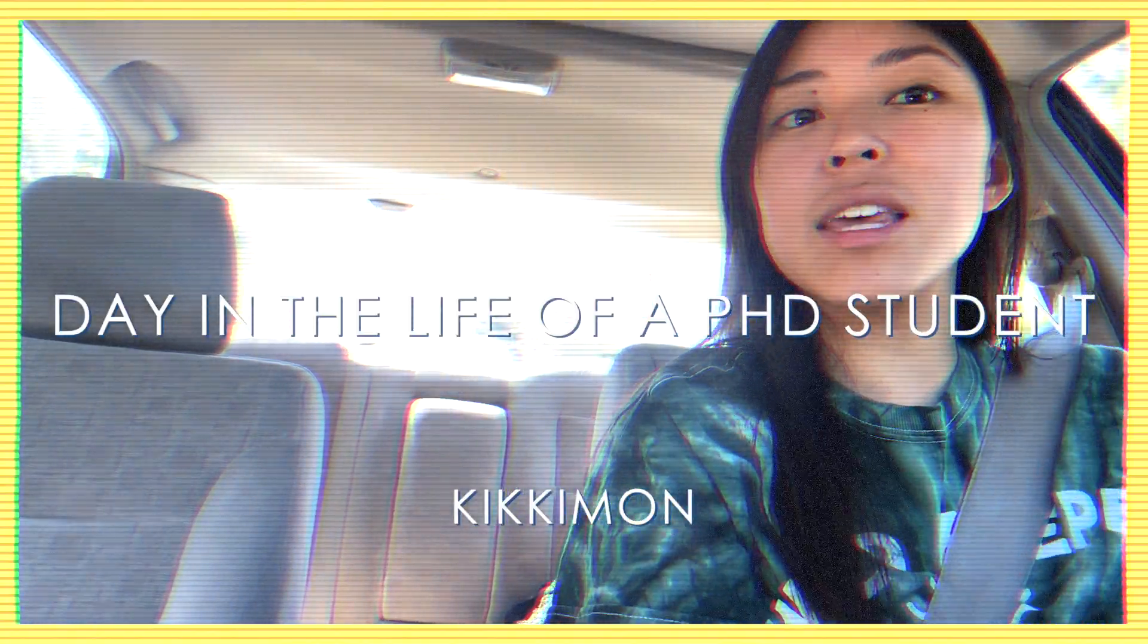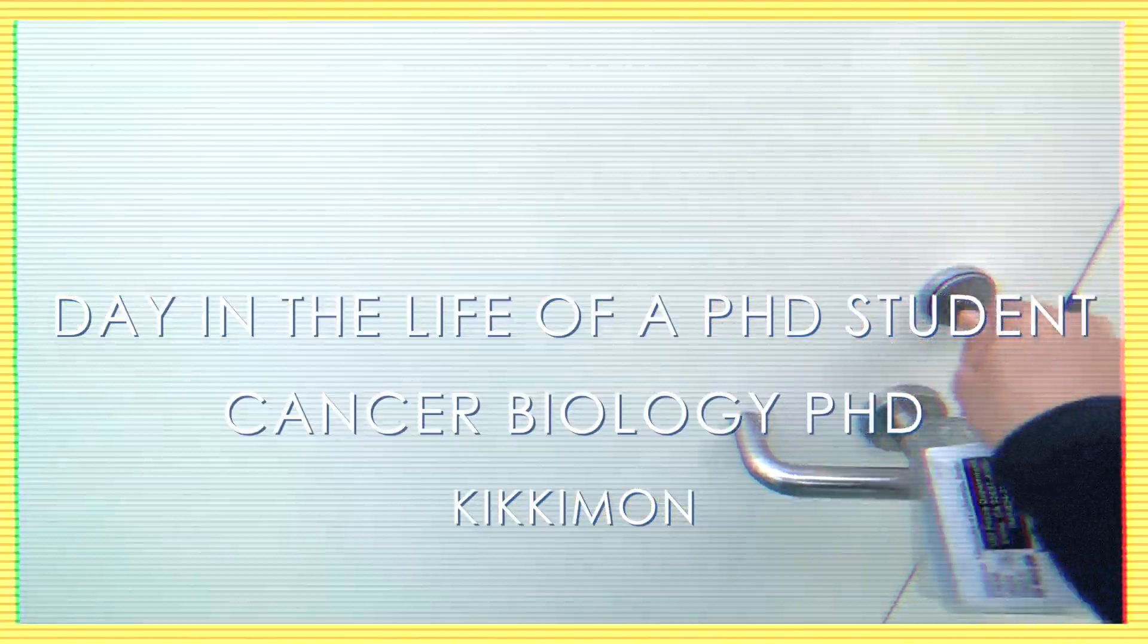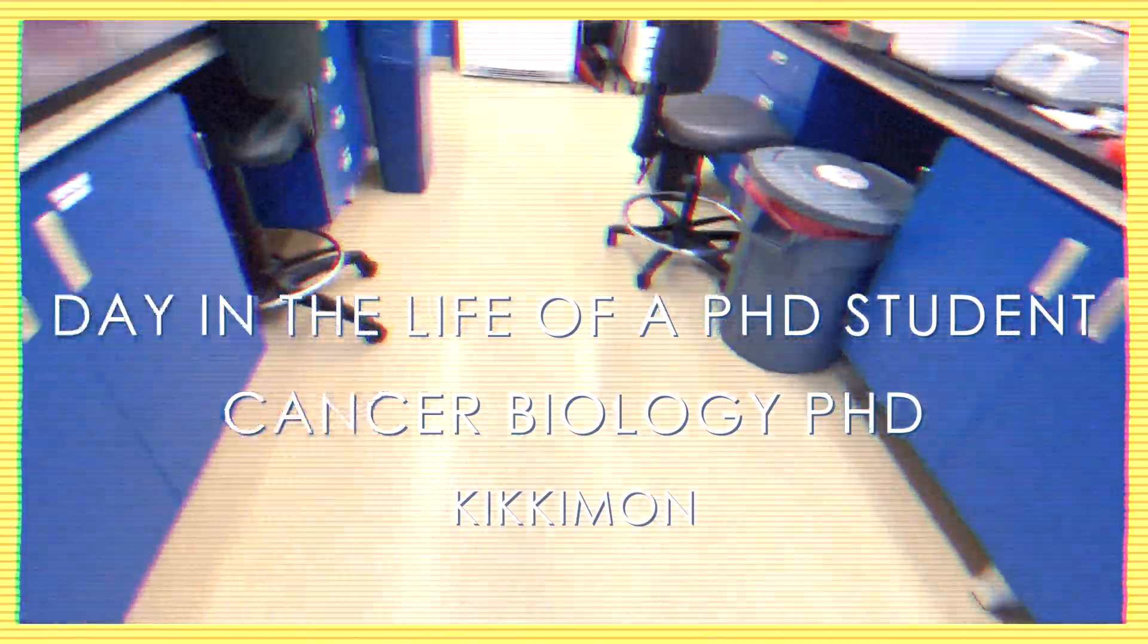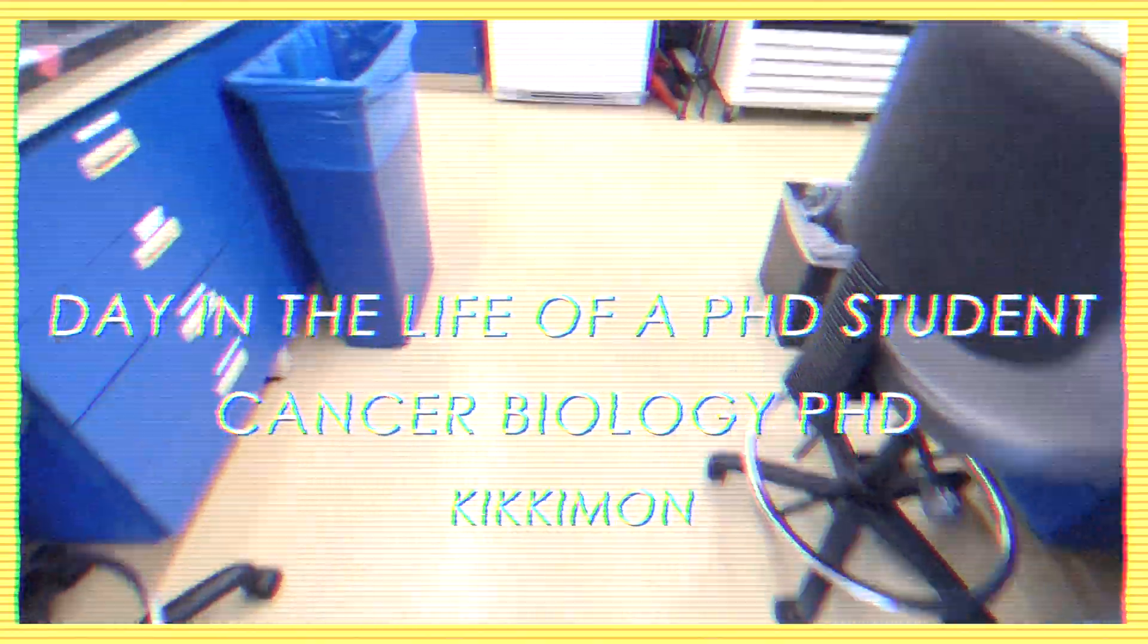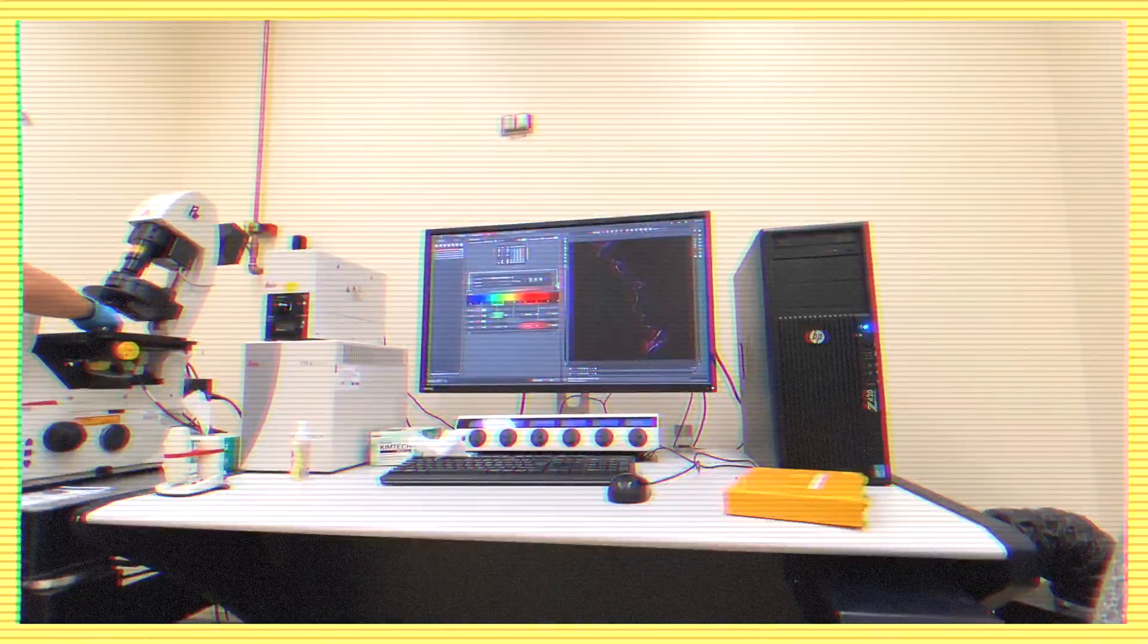Hey there friends! It's Keek and this is my day in the life as a PhD student. I'll take you behind the scenes of a Saturday in the microscope room. It's a cozy, chill vibe so grab your coffee and let's hang out!